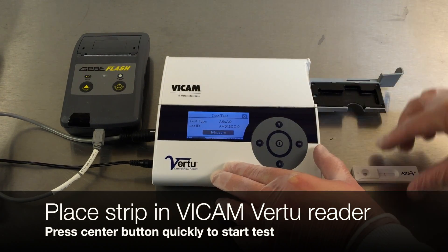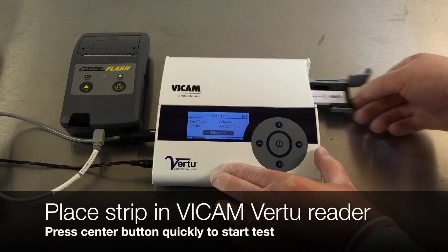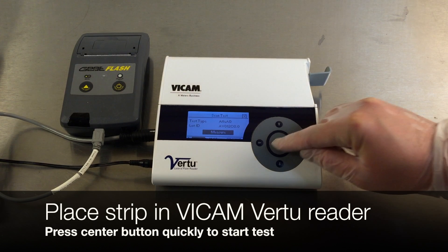After 5 minutes, place the strip in the Vicam Vertu reader. Quickly press the center button to start the test.